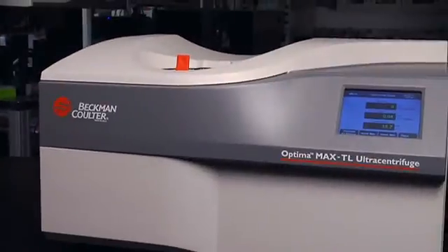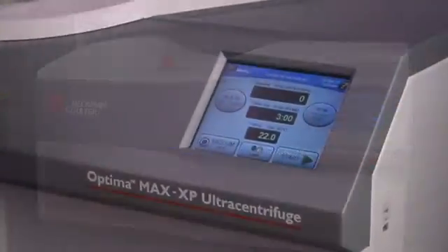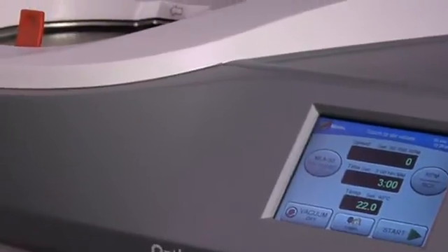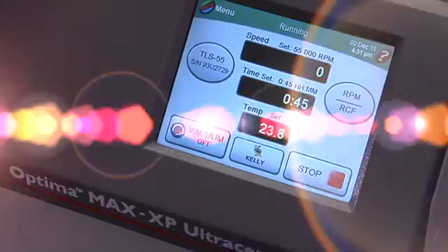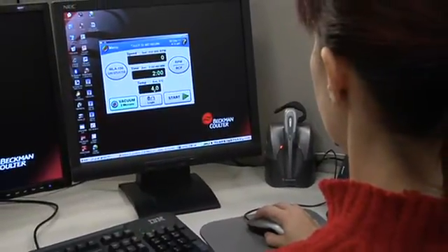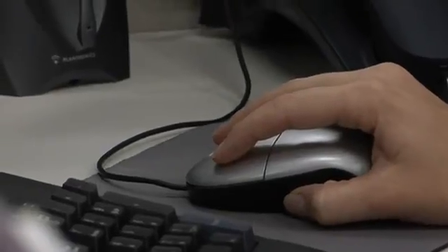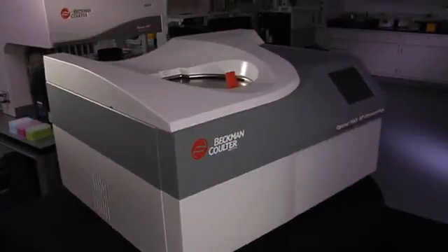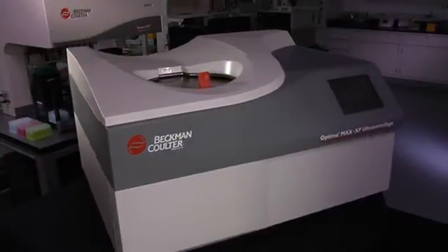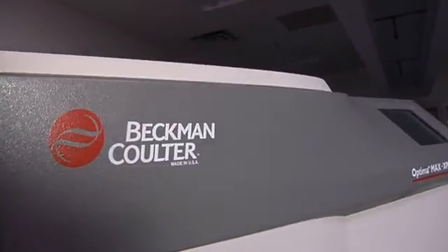The Optima Maxx series tabletop ultracentrifuges from Beckman-Coulter deliver a compact, versatile, power-packed ultracentrifuge solution to meet the challenges of today's research environment. User-focused, performance-driven, industry-leading, because we know your business revolves around the lab. But our business revolves around you.